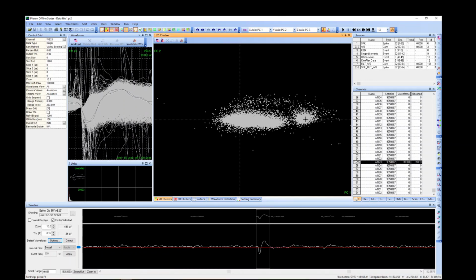The final waveform shapes you detect will heavily depend upon your region of interest, animal species, potentially the experiment conditions, and many other factors. Therefore, examining the waveforms in your data to decide on the best waveform settings is essential.